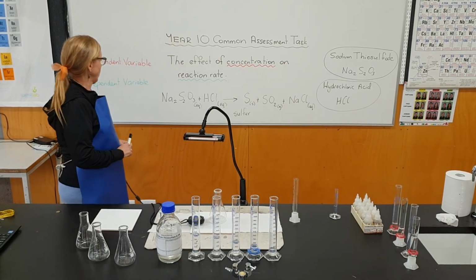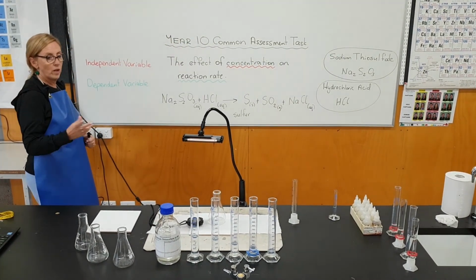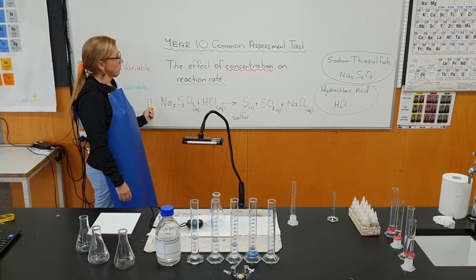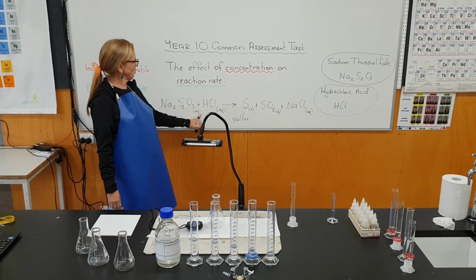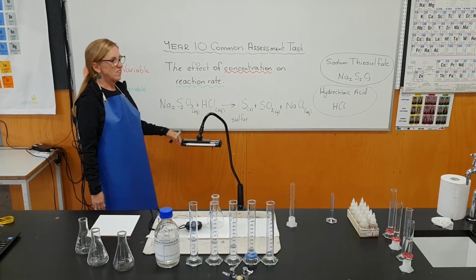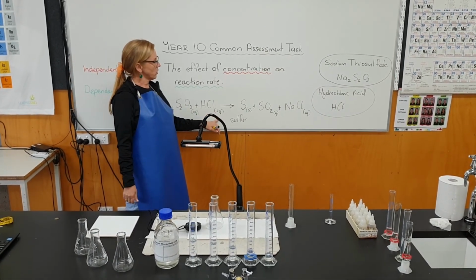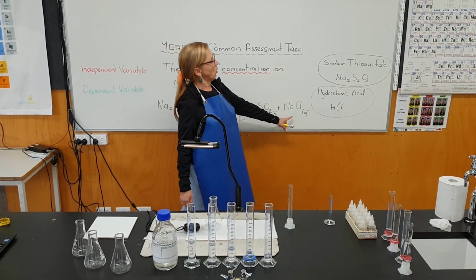Just looking at the equation, which you'll have with your handout anyway. So we've got the sodium thiosulfate, and we've got an (aq) in the brackets after here, which means that it's dissolved in solution. Same with our hydrochloric acid, it's in solution, as is our sodium chloride.